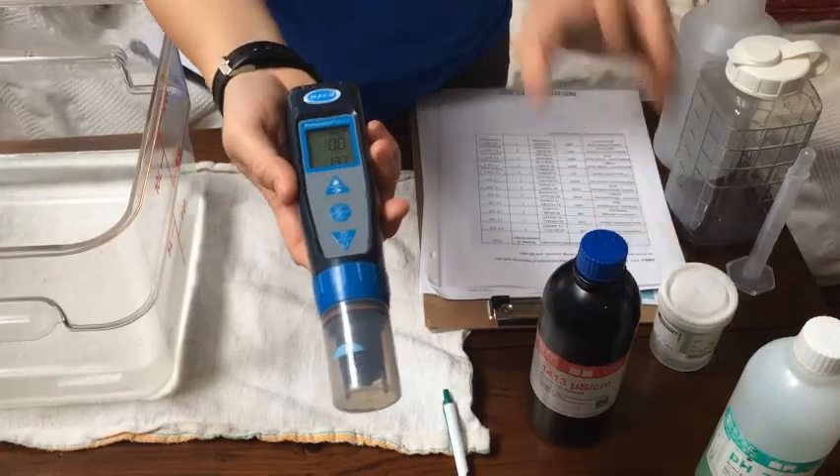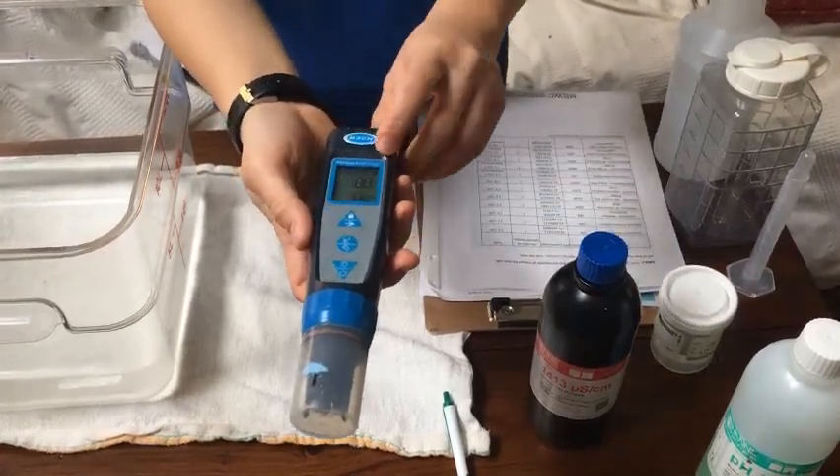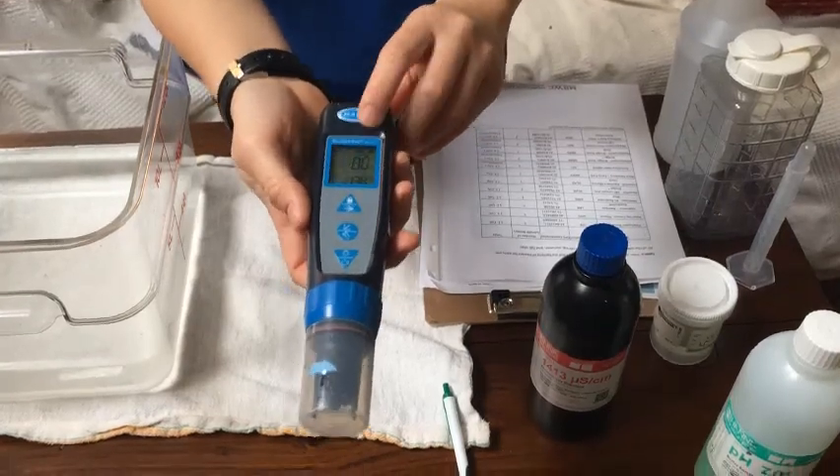I have bottles here, but you will have individual packets in your kit. In order to calibrate, you want to make sure you're calibrating with the right solution.